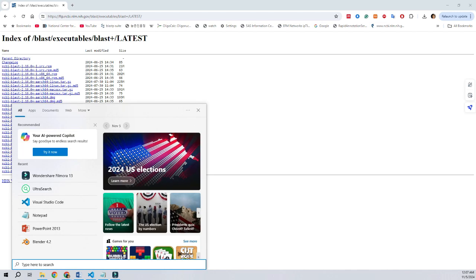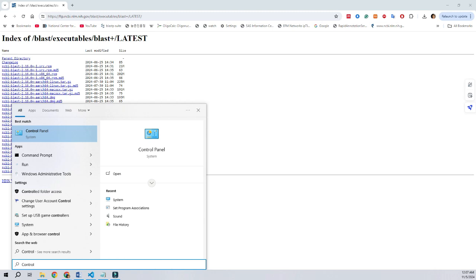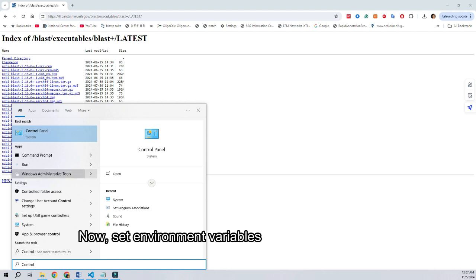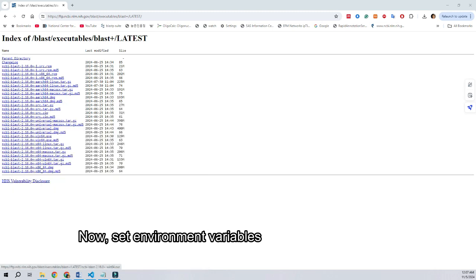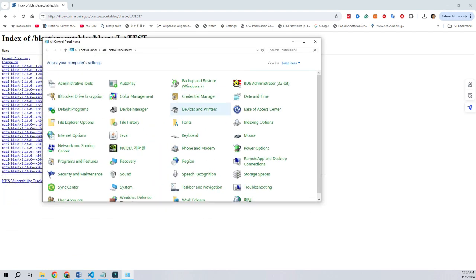Next, we have to open the control panel, go to systems and look for advanced system settings, where we have the ability to update environment variables.